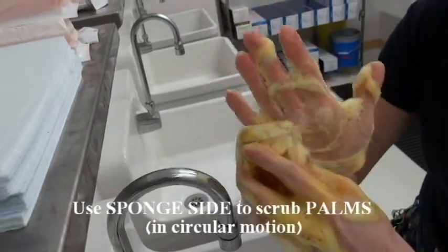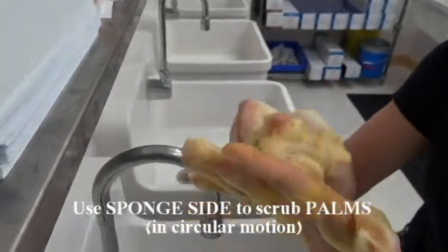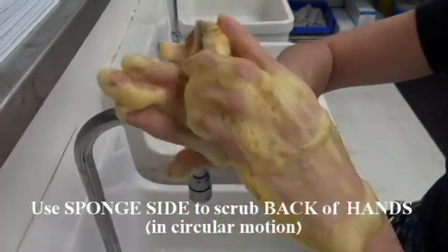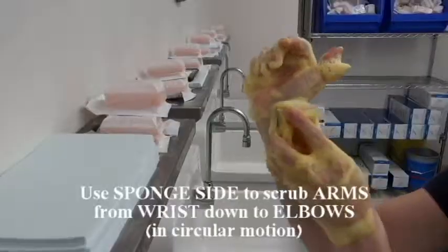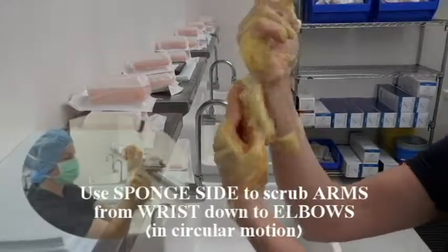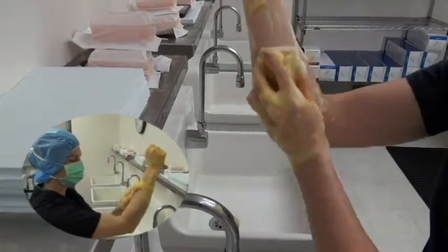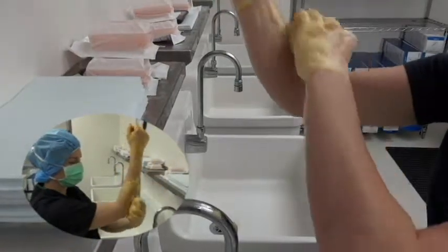In circular motion, scrub each palm. Then, also in circular motion, scrub the back of your hands. Lastly, scrub your arms starting with your wrists and down to your elbows. In circular motion, clean horizontally around your arm, not vertically. Do not return sponge to previously cleaned areas.